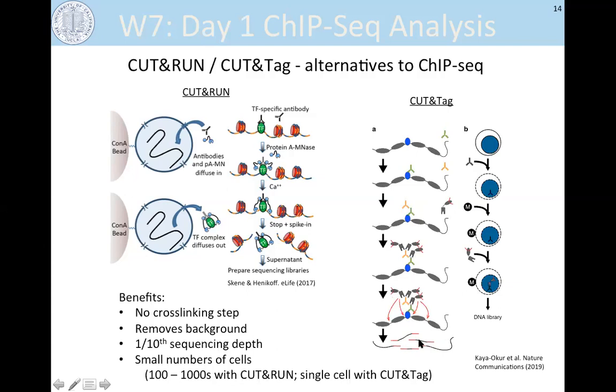So this is an improved protocol versus the MNase, specifically because it seems to be more robust than CUT&RUN, and you save yourself the time needed to construct libraries because you are directly ligating your sequencing adapters by the Tn5 transposase. So I think that's going to be an exciting assay as it gets developed more.